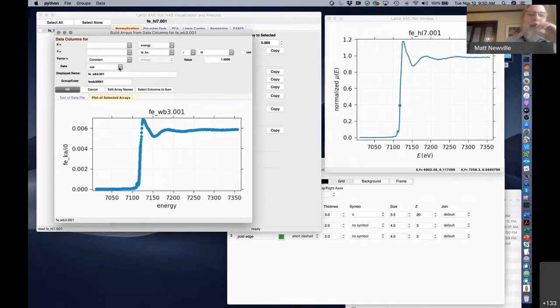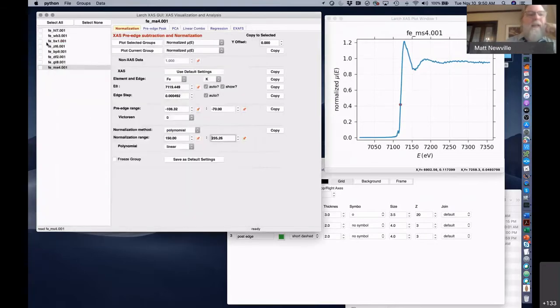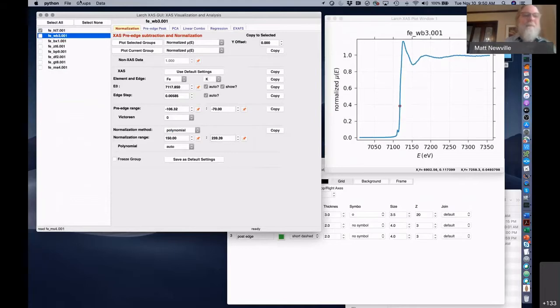So right, for reference, you have to read in the separate channel here, and then the energies. So you can read in a file twice, once with the data and once with your reference channel. That's probably because I find that while many people are using reference channels, they're often hard to predict where that reference channel is.